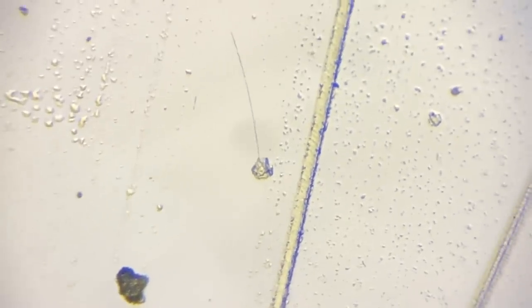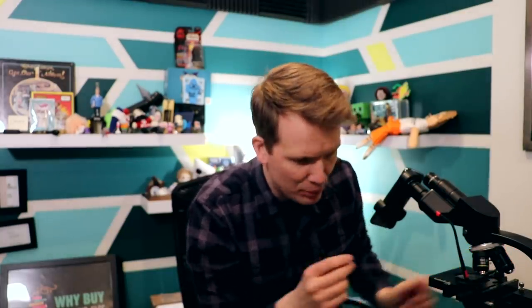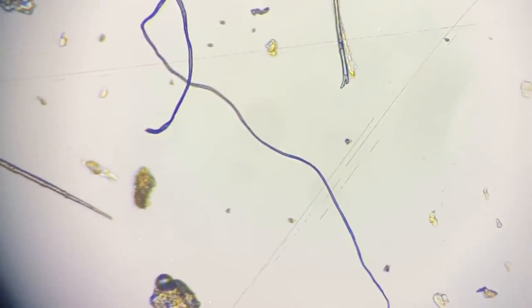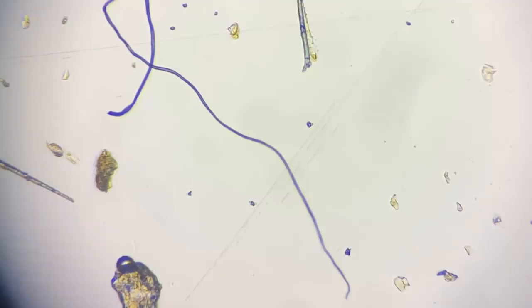That's a big scratch. So one thing I'm going to try now with one side is to actually put a slide cover on. It's roughly the same as what we were looking at. Oh gosh. Just flakes of skin. Lots of flakes of skin. Oh, that's definitely a fiber. Jeez. What is happening? How is that even stuck?